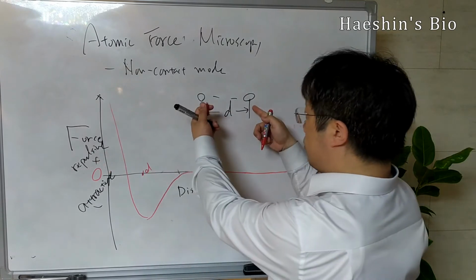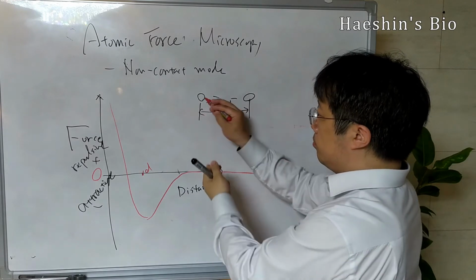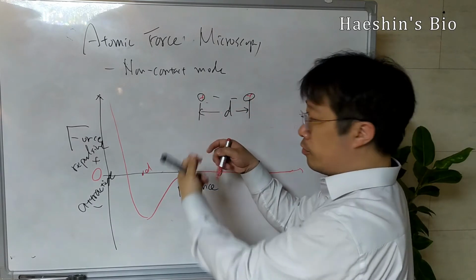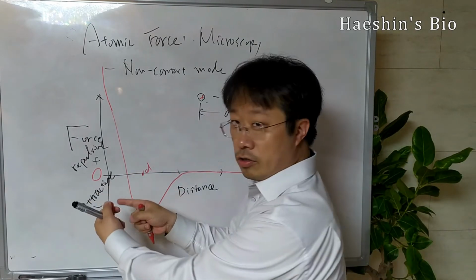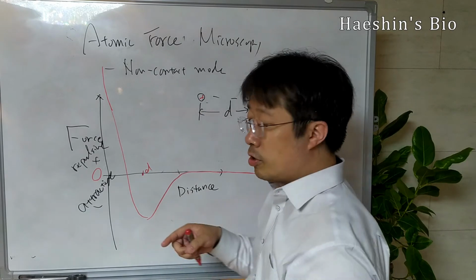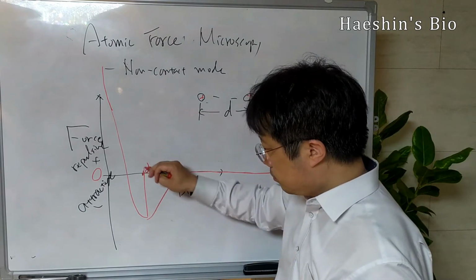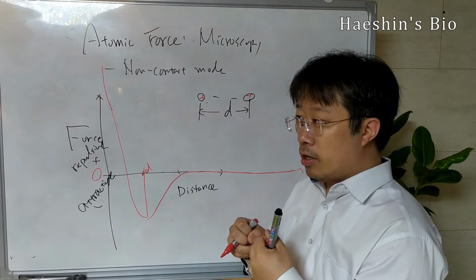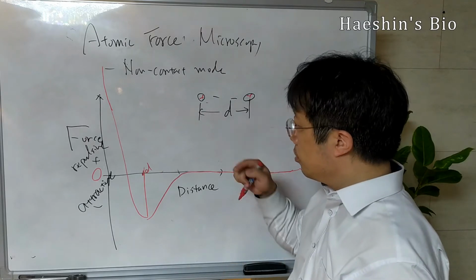These two atoms are close to each other, and because of the charge they provide repulsive force of infinite magnitude if they actually try to collide. So that will not happen. This distance d is the maximum distance to attach to each other, so this is maybe the energetically stable situation.